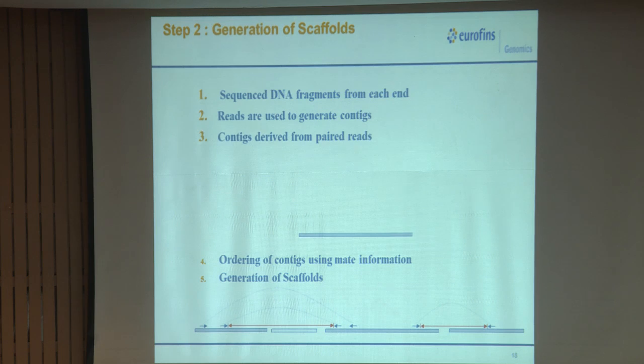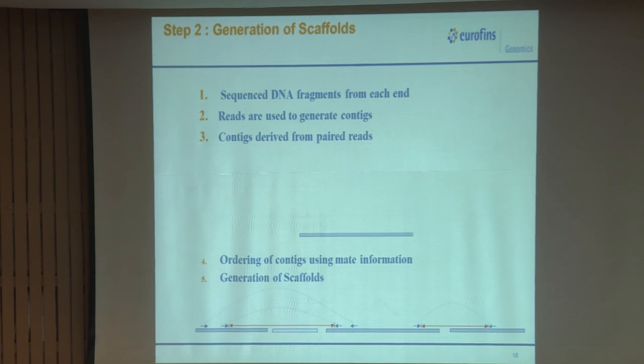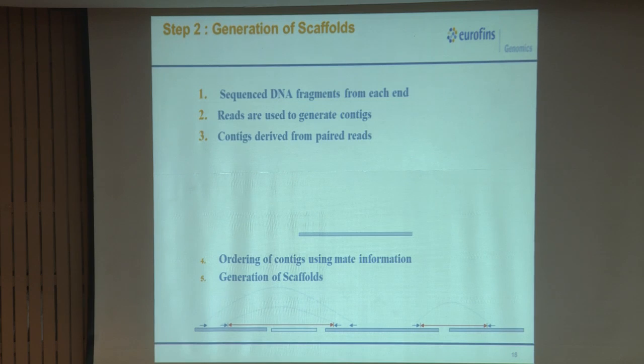If, for example, I am using one software to do scaffolding, it might not have got an overlap between those two scaffolds. But if I use some other approach, like De Bruijn, and go for an overlap, there are several ways we can connect it. I might get an overlap between the first scaffold and the second scaffold, then I can combine. Essentially, you need to use more than one software to assemble all your genome sequence.